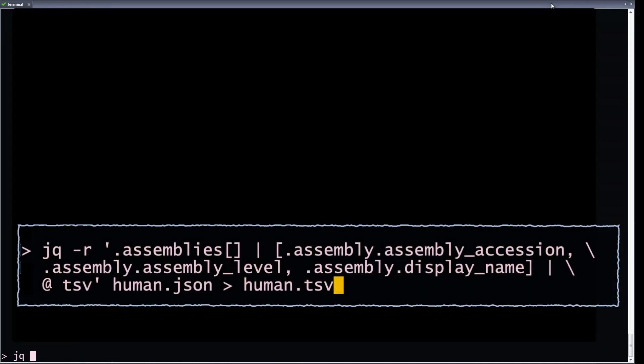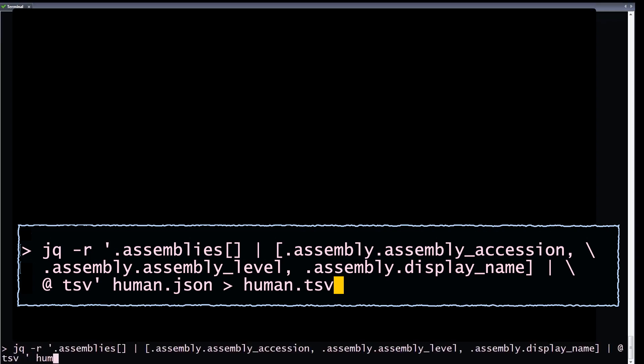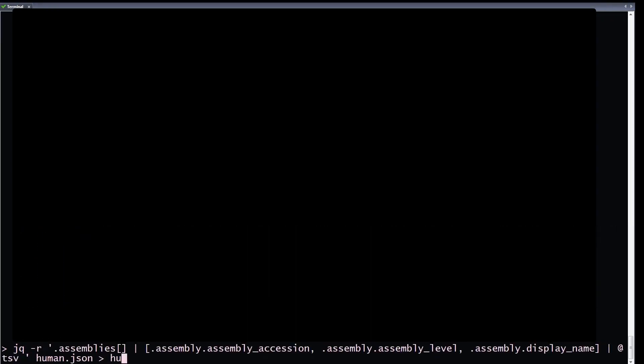Here is an example command that retrieves assembly accession, assembly level, and assembly name, and outputs the data in TSV format.